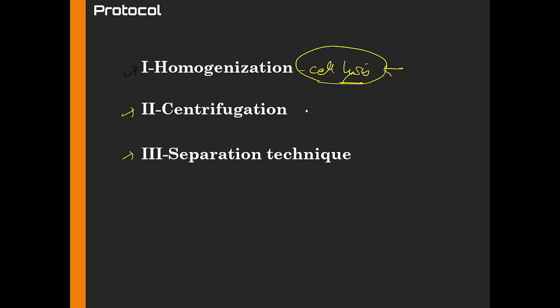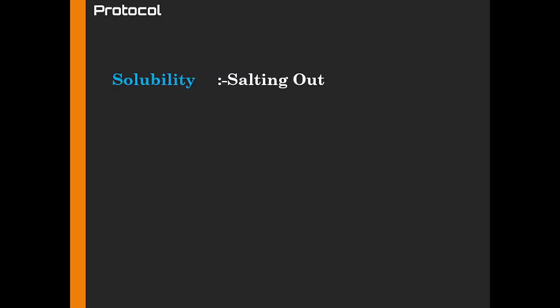But essentially, today we will be talking about the centrifugation steps and the separation technique. So focus on that. Centrifugation, most probably in the previous lecture we talked about that: what is RCF, what is G value, what is the RPM value as well, and the differential centrifugation for the isolation of mitochondria was explained. Now we will focus here on the separation technique.